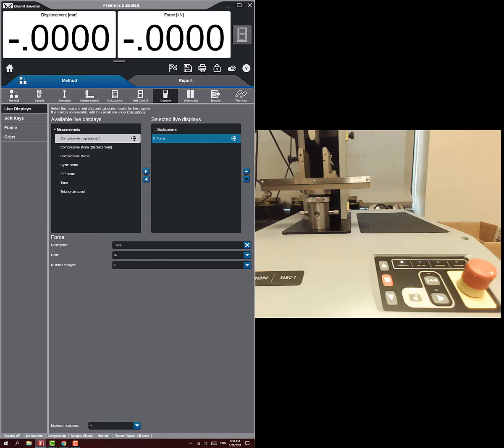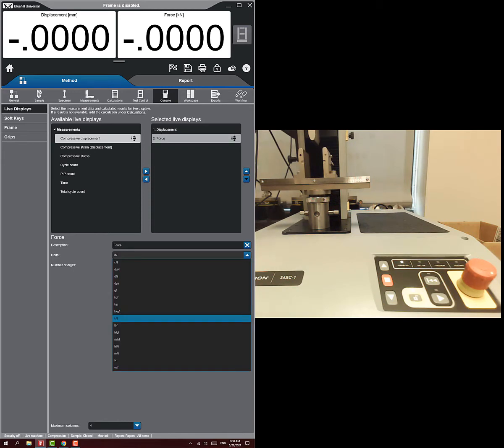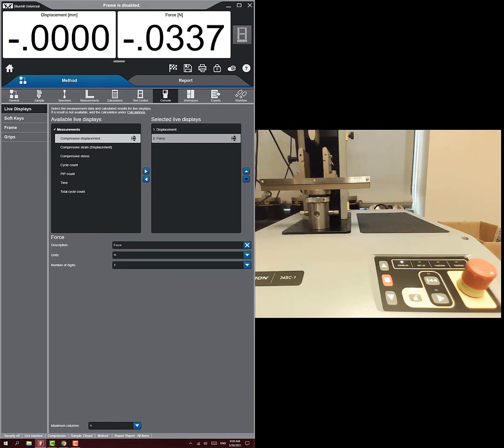On the console, we can change the display units. This is a one kilonewton frame so force will display in kilonewtons by default. I like to change the units to newtons with three decimal places, so we'll see values from one to a thousand rather than zero to one. We don't need to worry about compressive stress and strain calculations since we just care about displacement and force.